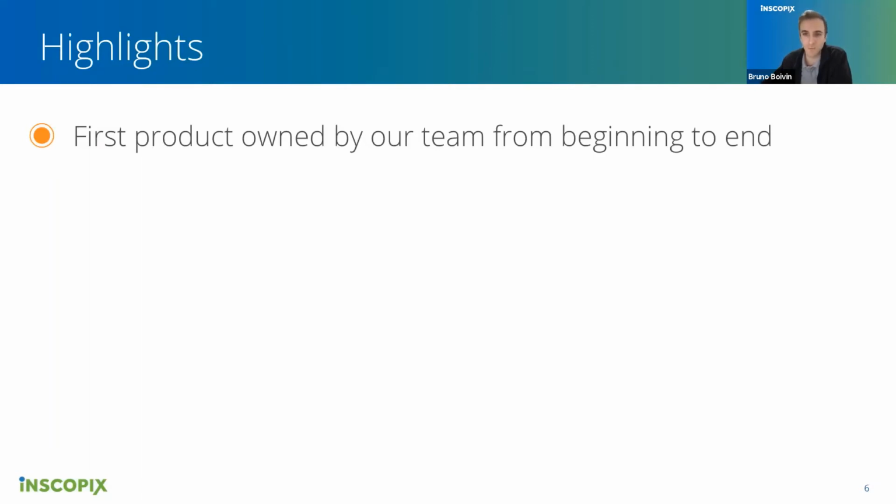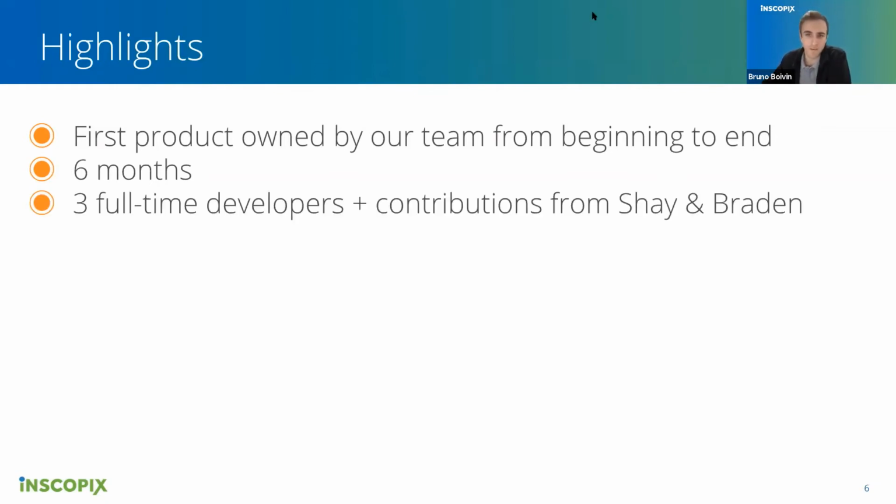So one of the big features that we own from beginning to end is the development of CNMFE. It took about 6 months to re-implement this algorithm. So it's really a big algorithm, despite the fact that it might look simple from the user's perspective. There have been 3 full-time developers, so always two developers at the same time, myself and a co-op. And there have also been many contributions from Shay and Braden.